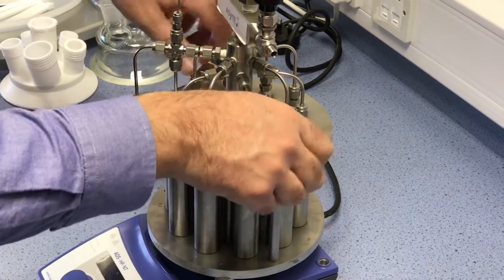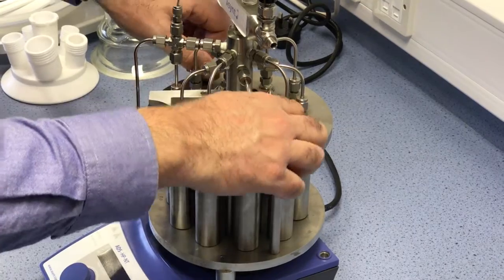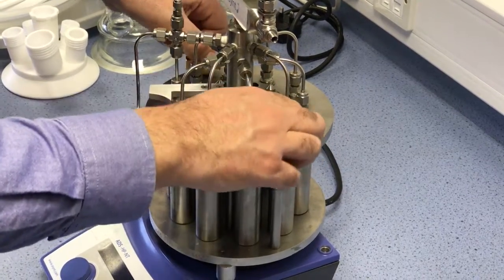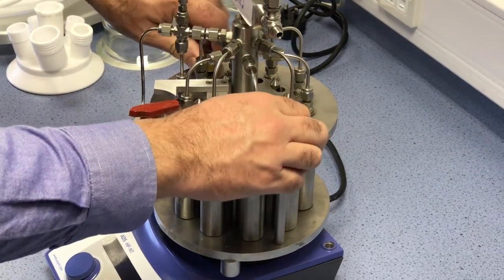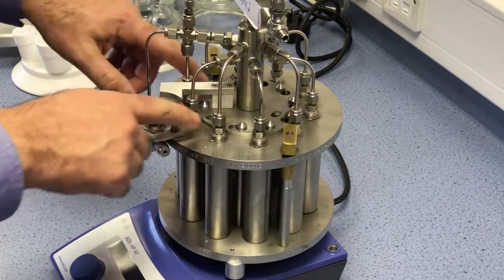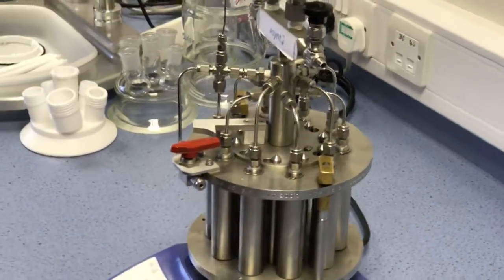Once we've done that then we turn these anti-clockwise and lift up the unit until we can feel a little bit of tightness and then we've got it locked on the plate and it's now safe to use at 50 bar.